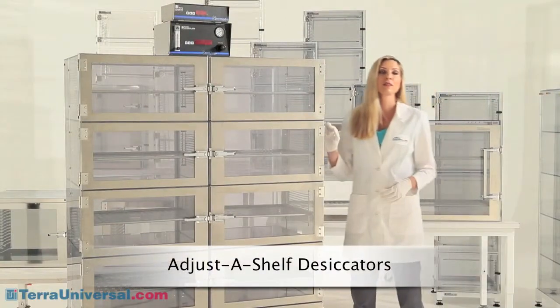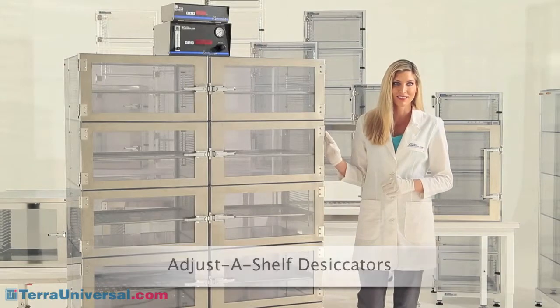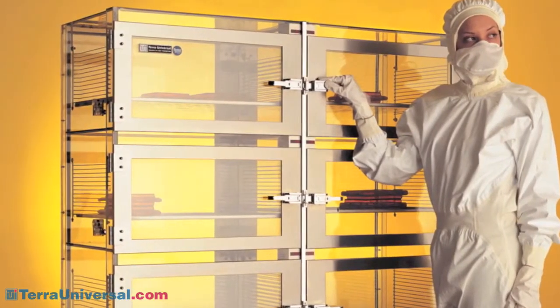The Adjust-A-Shelf desiccator is the most versatile and most popular of Terra Universal's desiccators. These cabinets reflect over 30 years of continuous product improvement, making them the most advanced on the market.